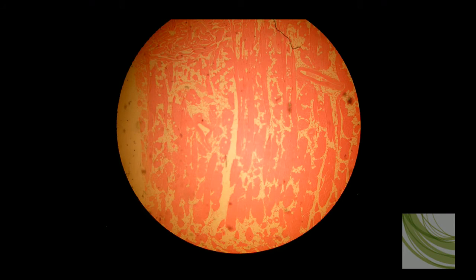Here is some more skeletal muscle on a second slide. These are some very scattered fibers. Looks like we have some cross sections and some longitudinal cuts. There's a lot of adipose tissue scattered around — this would be called marbling in a steak.